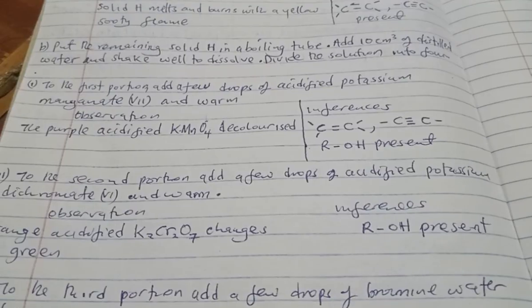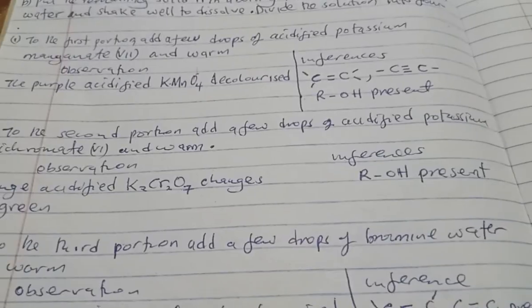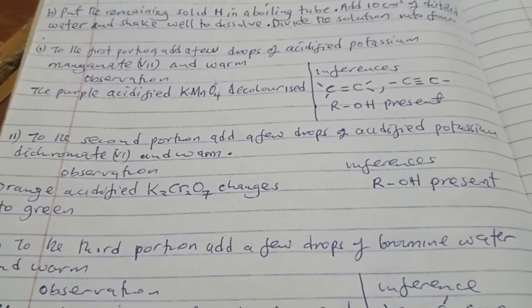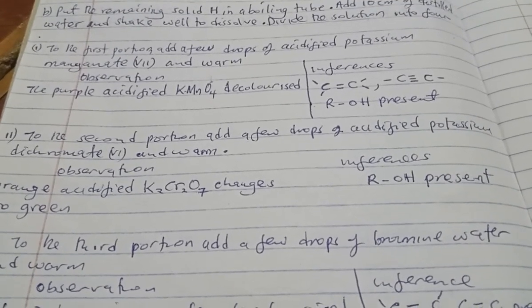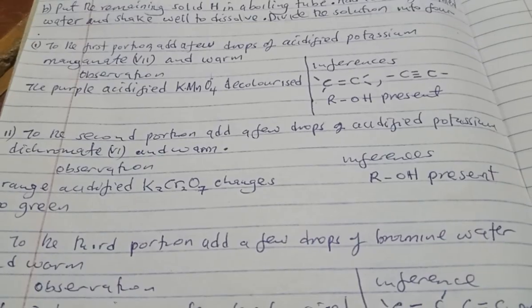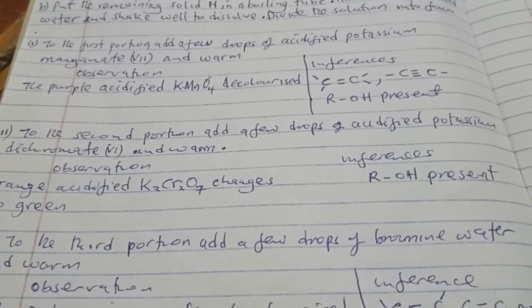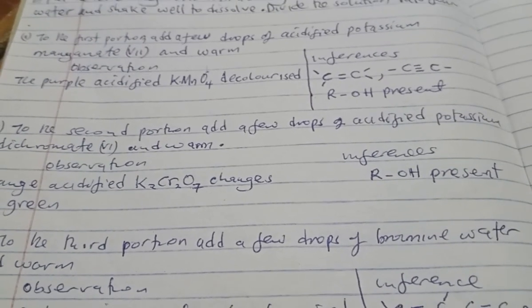Then maybe to the second portion, you are required to test using acidified potassium dichromate(VI) and warm. You normally warm so that the green color can appear well. So if the orange acidified potassium dichromate(VI) changes to green, then we say ROH present. We are confirming what is up there.